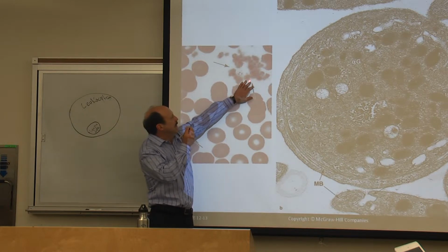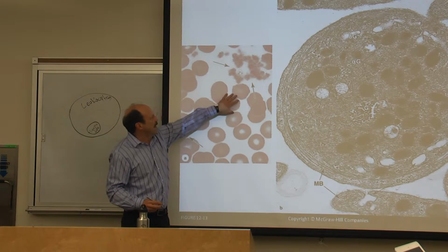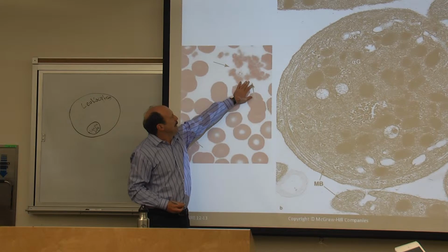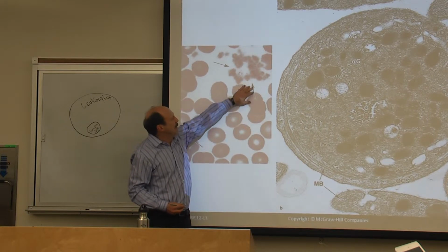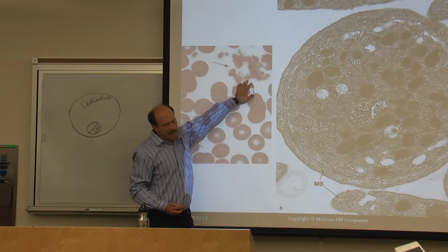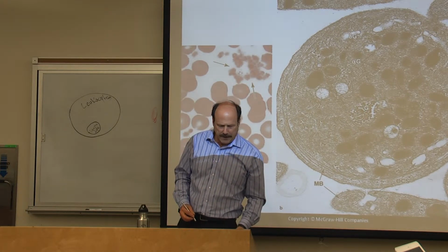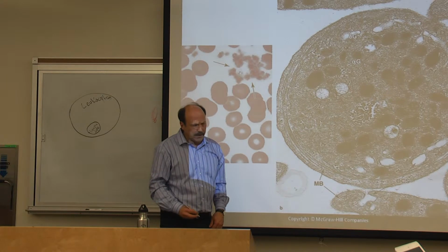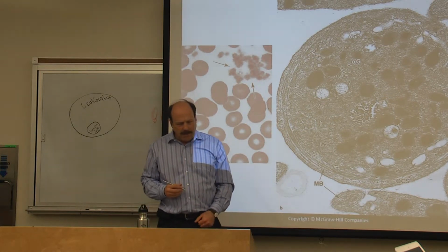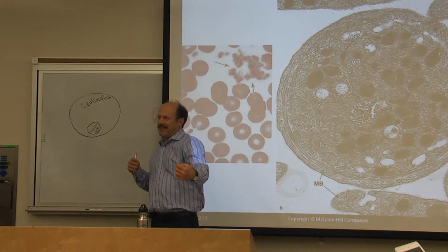If you see little things, it's probably something smaller than a red blood cell. The red blood cell is kind of the size marker because there are so many of them, and it has such a uniform size, about 7.5 micrometers in diameter. Anything smaller than that is probably a platelet. Occasionally a large platelet will get released, but platelets are usually just these smaller pieces. If it's round, it's probably human. If it's elongated, it's a yeast or a bacteria.